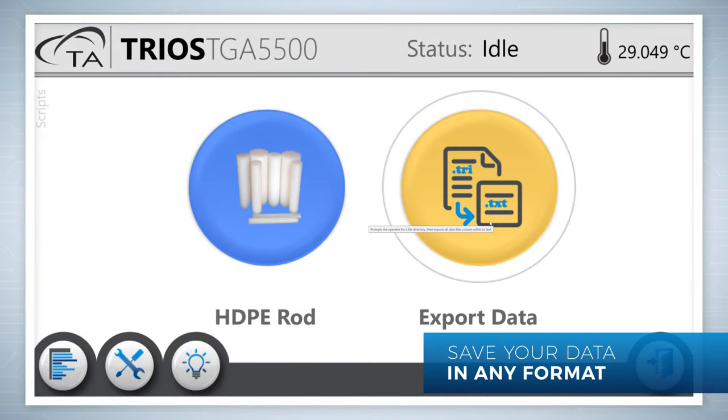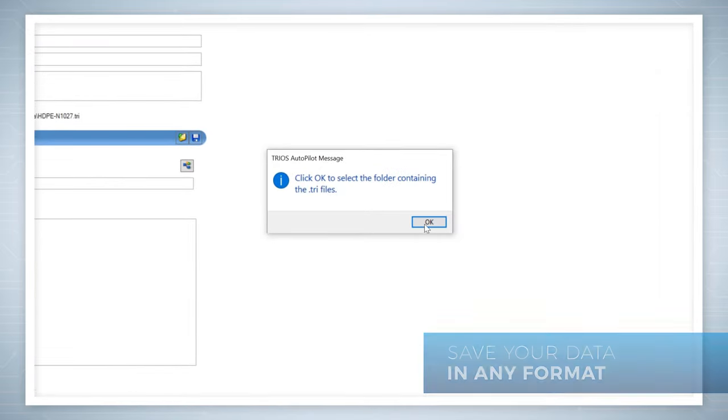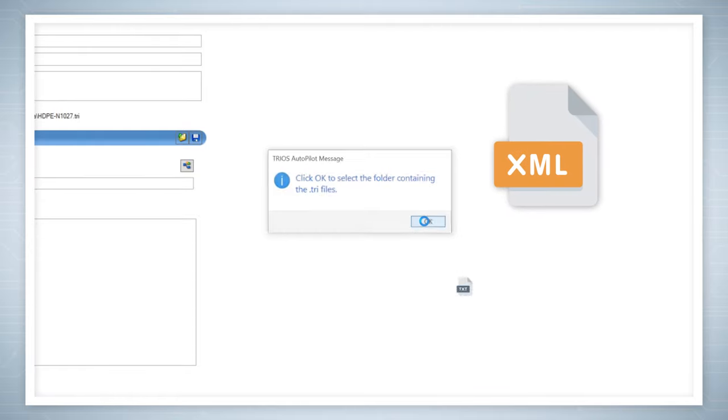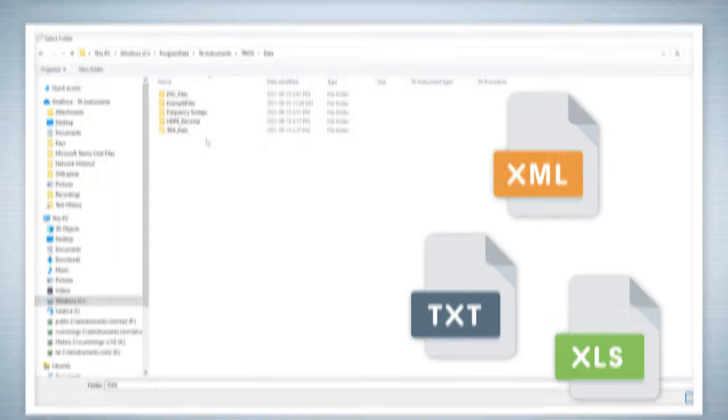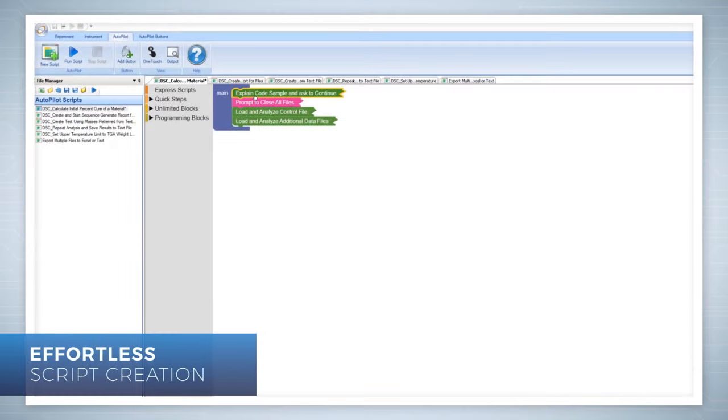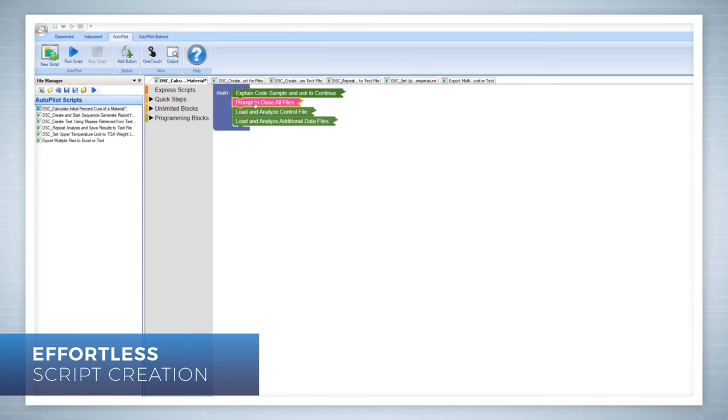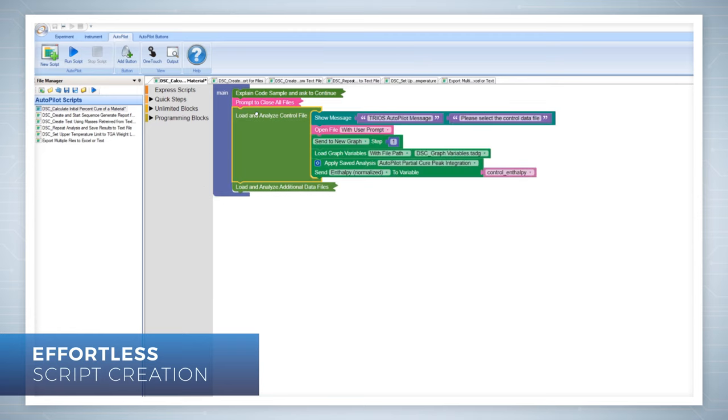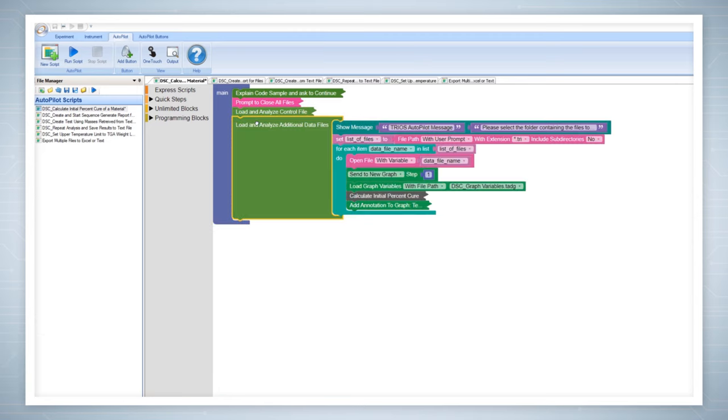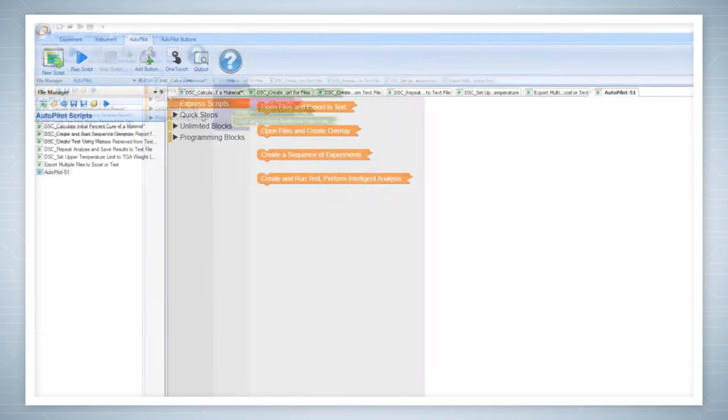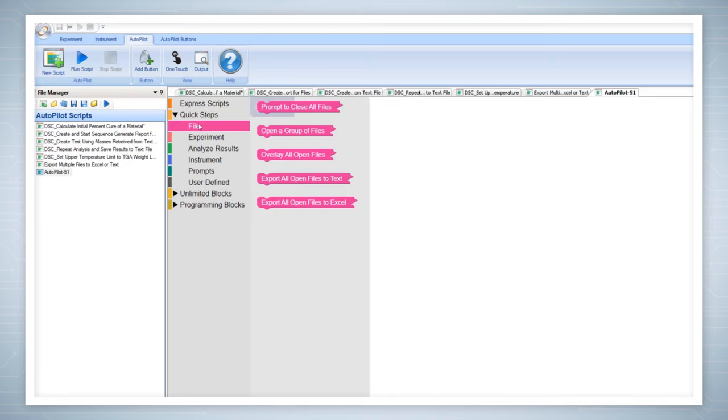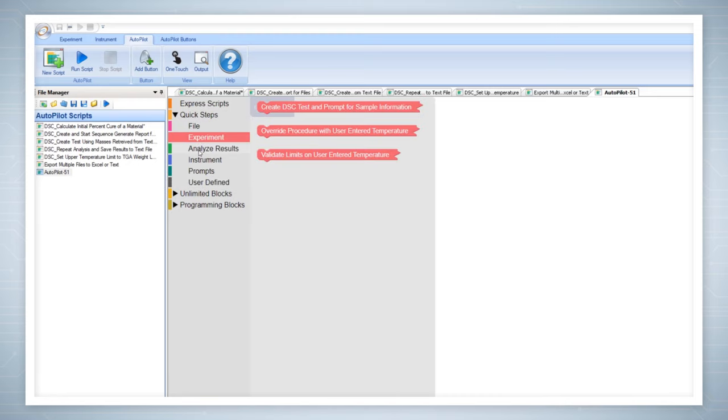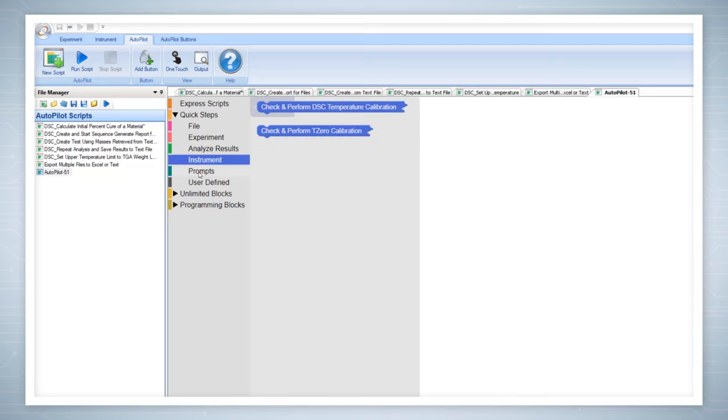Save your results data in any format for effortless integration with third-party lab management solutions. Script creation is effortless with Trios Autopilot. No training or programming experience required. Perform complex tasks using the included example scripts or create your own express scripts, quick steps, or unlimited blocks.